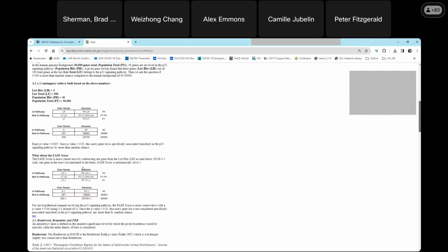there is one gene associated with a given term. Sometimes those p-values can be very inflated, but the fact that we only have one gene on our list gives us pause, right? We don't trust that. So if we simply subtract one from the number of genes that are associated with a term, it takes care of that situation. So that's the modification.